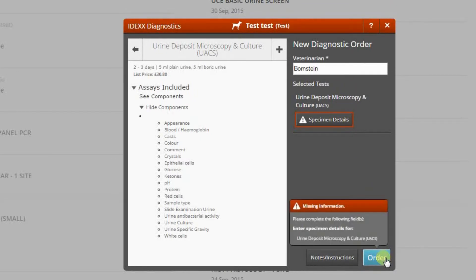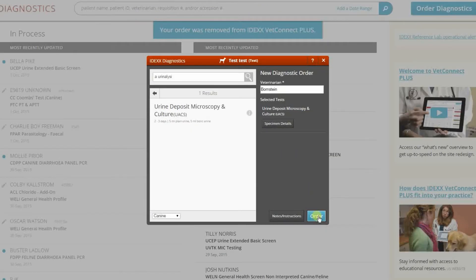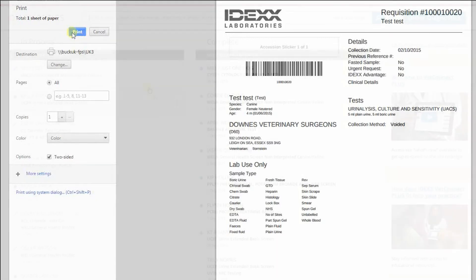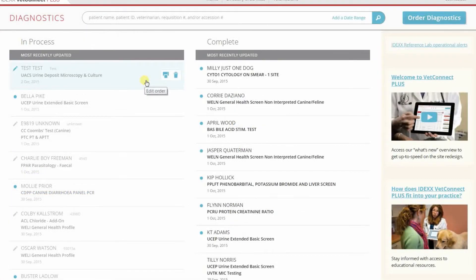Be sure to select the veterinarian and provide any other required information. You'll see a warning if information is missing. Your test requisition form opens automatically along with the print box. Print the form and place it in the courier box along with your sample. The homepage displays the new order at the top of the In Process column.